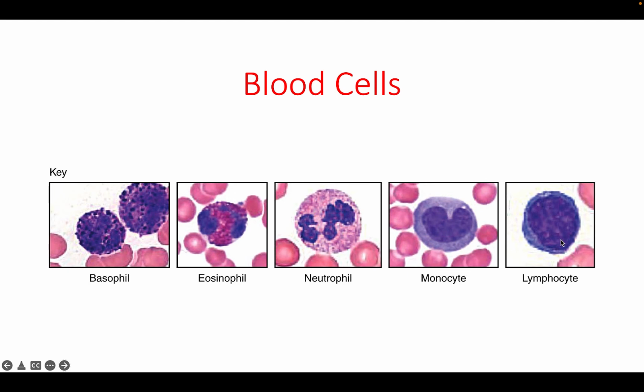So the lymphocyte and the basophil get commonly mistaken. The lymphocyte has a bluish, purplish background. The basophil has some pink back there. The lymphocyte has one big globular nucleus, a full moon nucleus, whereas the basophil has a bunch of polka dots. All right, so we're looking at a really misshapen nucleus in the basophil and a very solid nucleus in the lymphocyte.